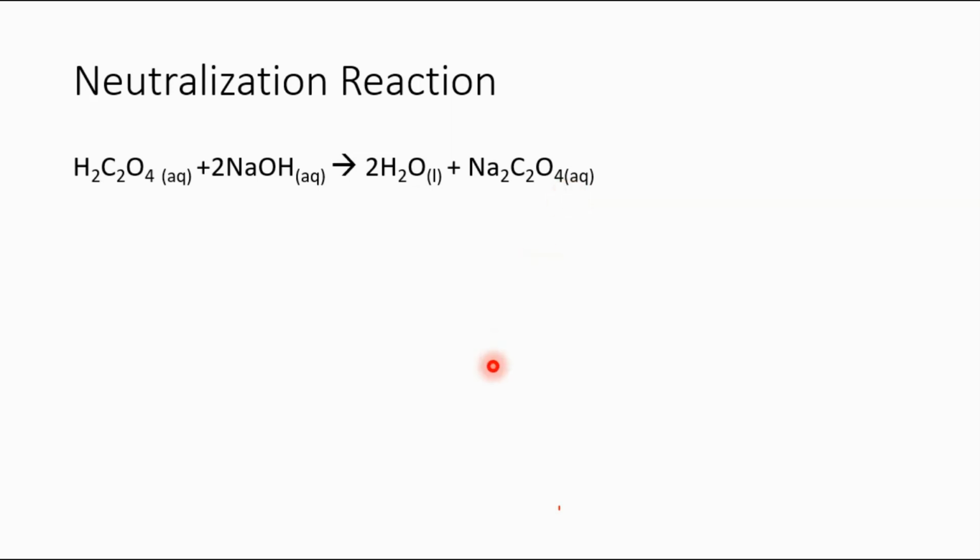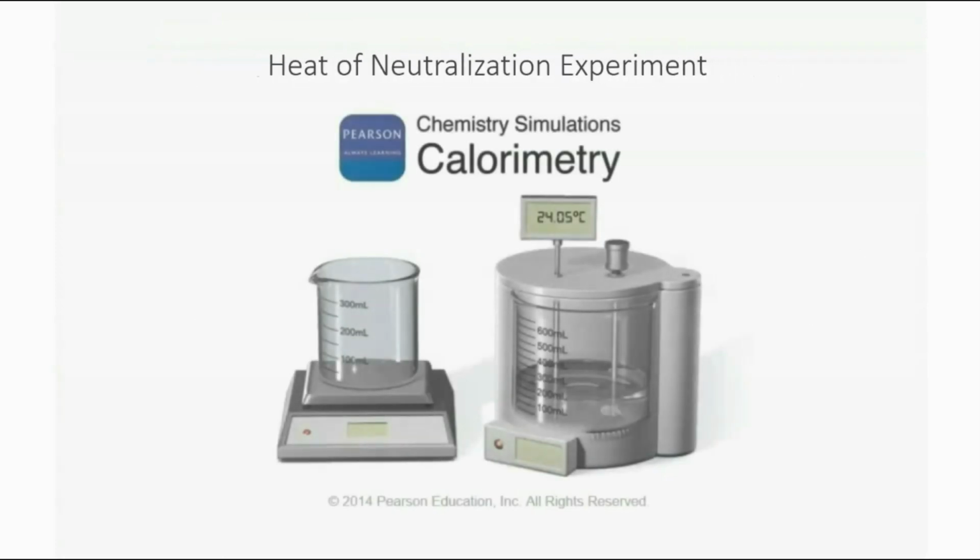And the heat from this reaction, whether it's released or absorbed, is going to be measured from a calorimeter. It's an apparatus that measures the heat involved in a physical process or chemical process. Now I'm going to show you briefly how to run this simulation for our experiment.